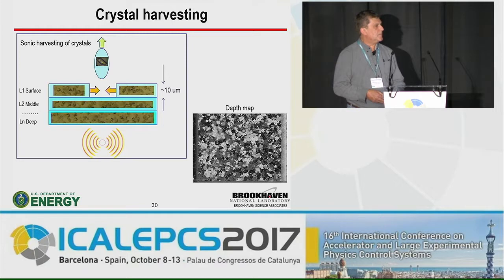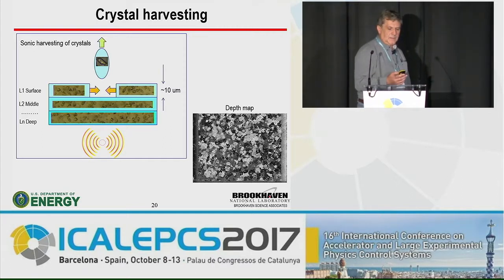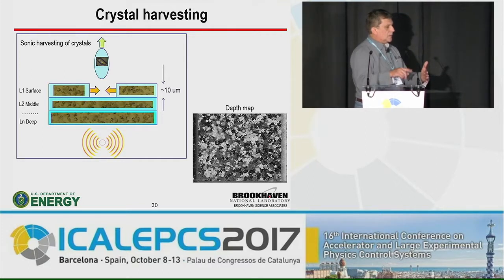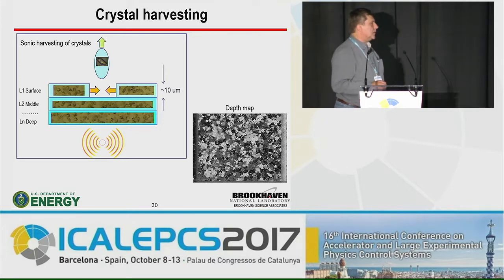How do you do the alignment of beam and your objects, and to what precision? You have these different microscopes. What we do is place a scintillator crystal at the sample location, and we determine where the beam is striking, the beam profile. Then when we place the sample in that location, we already have a crosshair that is provided, for example, by the area detector, and then we know exactly where the beam is.